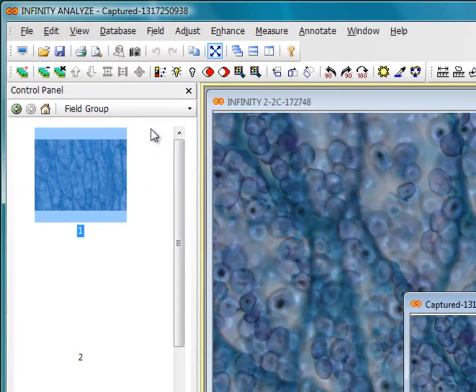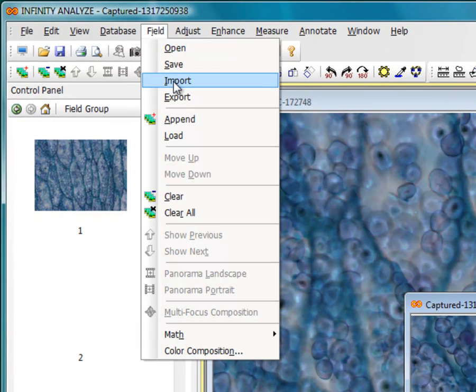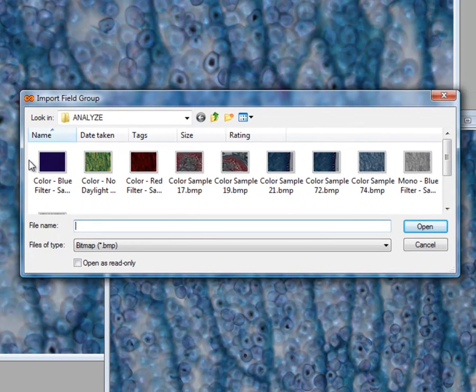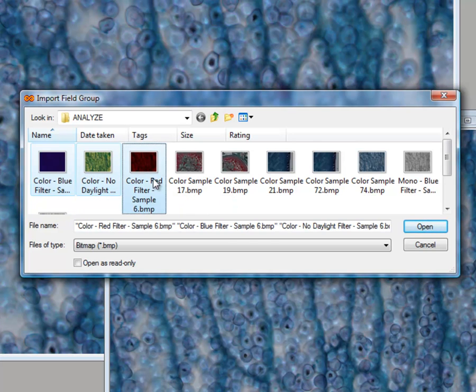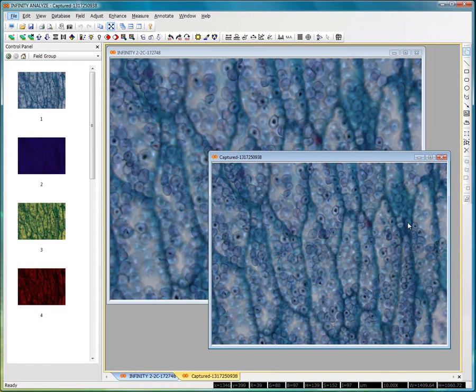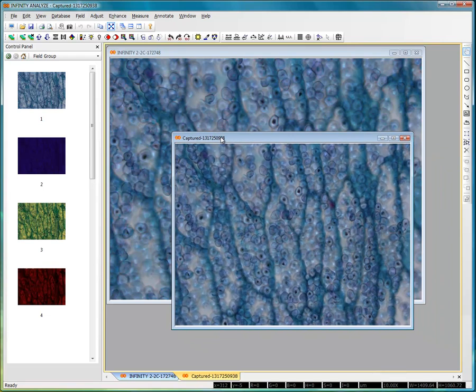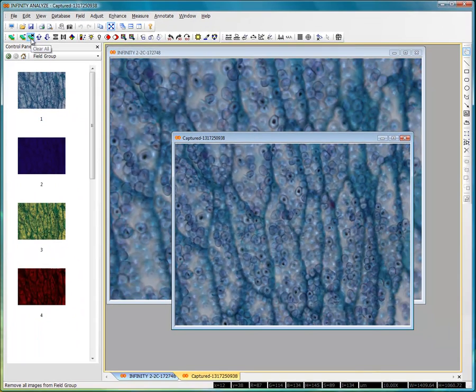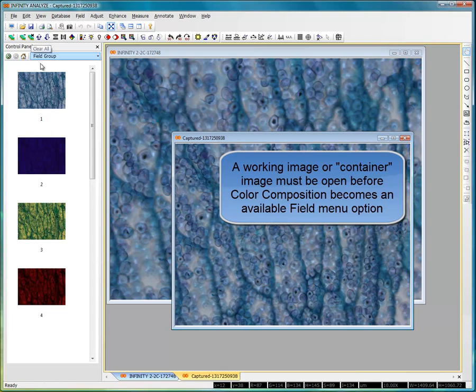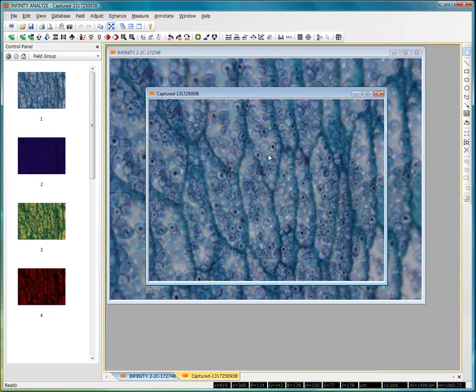Going to the field menu allows me to import images from folders elsewhere. I'm going to select some colored images from the import menu and select open, and notice how they go directly into the field group. Any images that have been previously captured can also be added directly into the field group, and field group toolbars are up here for adding images, removing images from the field group, or clearing the field group. It's important to note that you must have one captured image or opened image file available in the working area of Analyze in order for the color composition menu to be available.